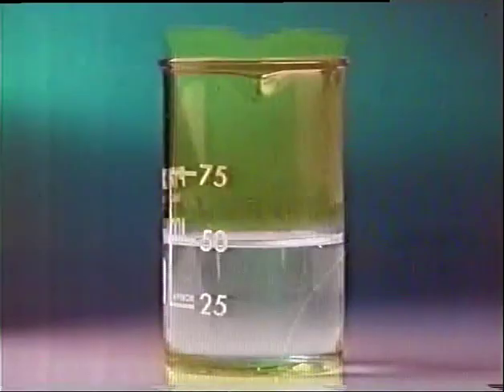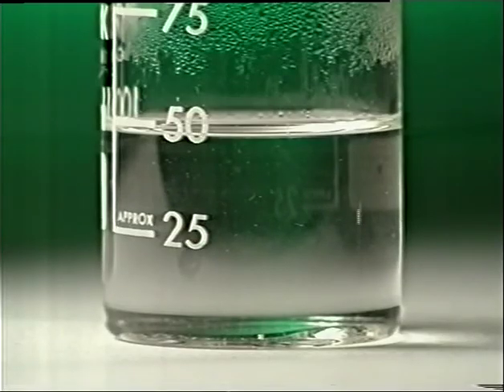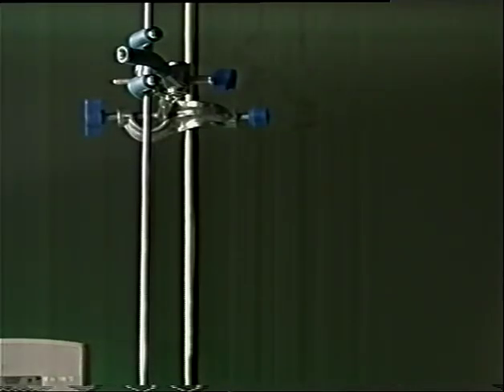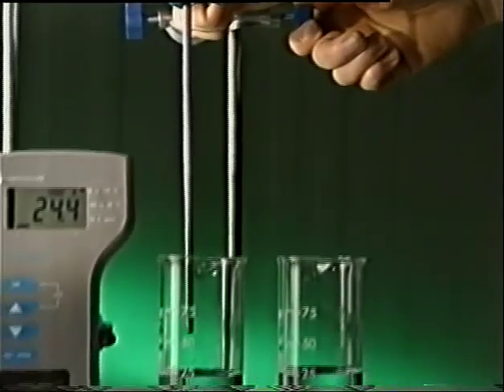Hot objects show up as white. As the two reactants are mixed, the beaker immediately gets hotter. Heat energy is being given out by the reaction, causing the temperature of the chemicals and the beaker to rise. An electronic probe measures the temperature change.